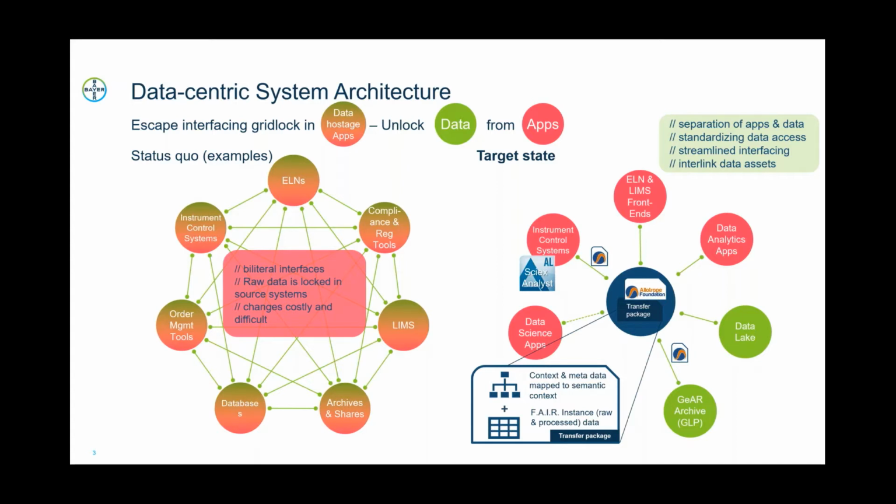And the other piece is a cloud-enabled converter where the Analyst data model is converted to an ADF file. I'll turn some time over to Henning from Bayer to talk about their particular implementation and the larger picture there at Bayer.